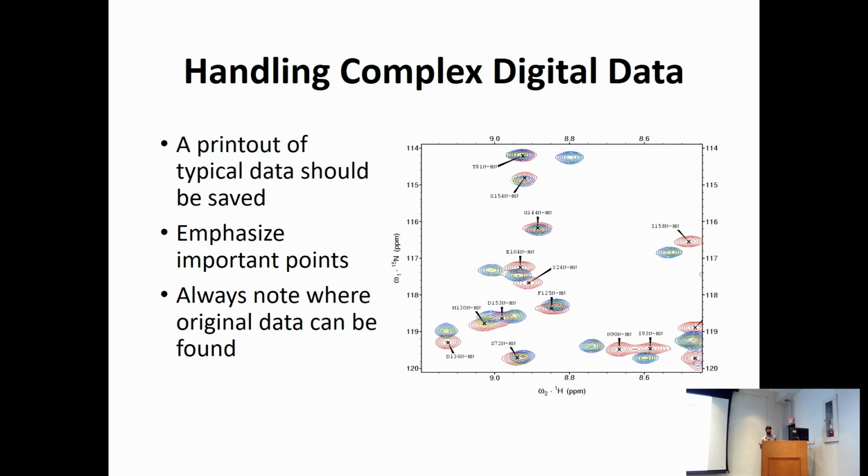So the major thing emphasized from this slide is that you always have to keep in mind where the original data is. You have to store it in a secure place, and also you have to back up your data.